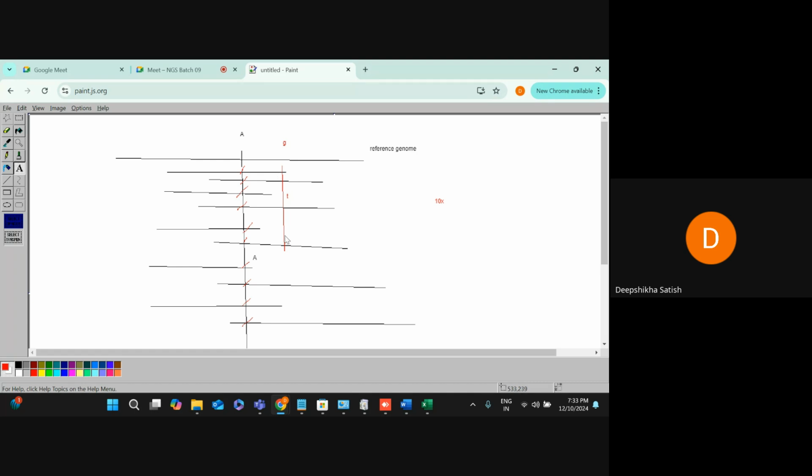So from this data, you can also tell me this type of data is having the mutation. Why? Because on this reference genome, there was the G present here and it was getting replaced with the T, right? So here we are saying that it is calling the mutation here. Okay. Now, but what is the depth for this T here? Can you tell me?